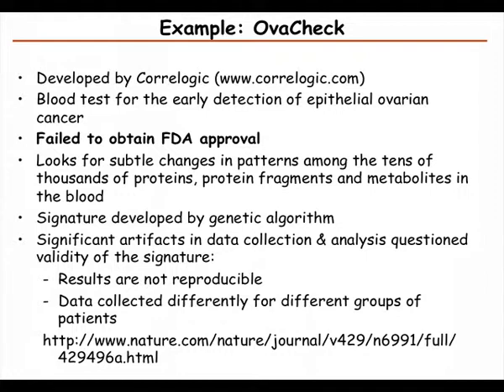And there was an instrument that was marketed to and sold to many hospitals, including NYU, which also had an instrument like this. This first 2002 Lancet paper led to a lot of interest, and it really didn't work. Now that mass spectrometer is gone from the market.